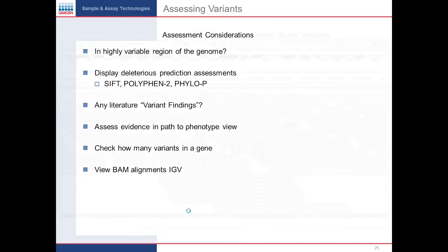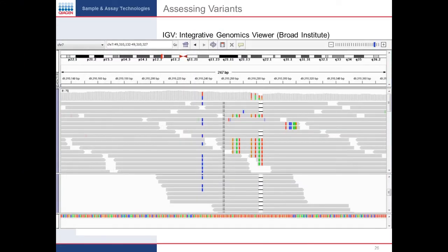go look at your analysis. And this is a screenshot I took from that viewer. I think it really helps to just go look at it. For example, here we have the chromosome view up top. We have a more zoomed-in view here in the middle, and then you can see down here all the reads that span a particular variant.